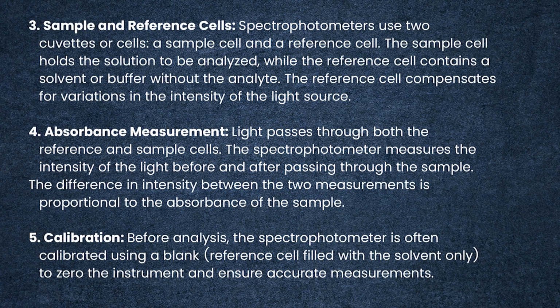Next is the absorbance measurement. Light passes through both the reference and sample cells. The spectrophotometer measures the intensity of the light before and after passing through the sample.